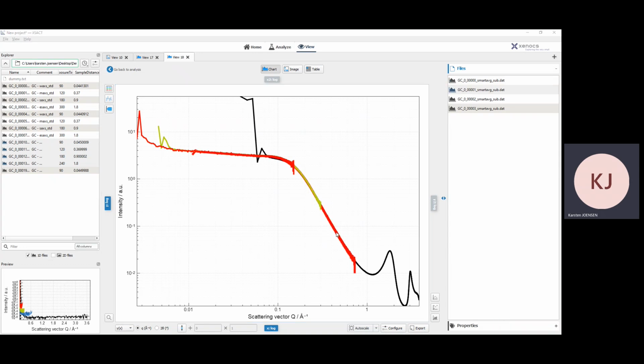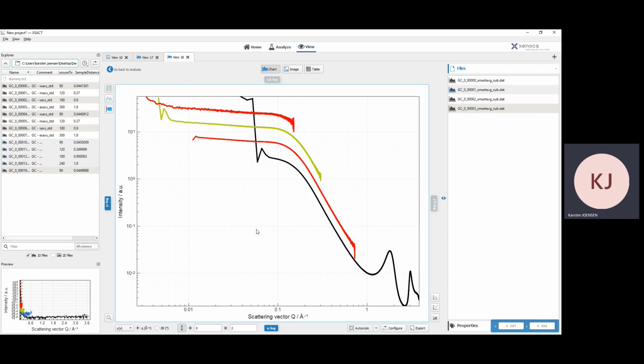We have something in here now. We have that curve in here for max, which goes up to, let me just click on that and see if we can get that highlighted. That was this one, that's that one. It's not really easy to see. For ease's sake, we can separate them by a factor of 2. So in this case here, we have this one here, which looks nice.